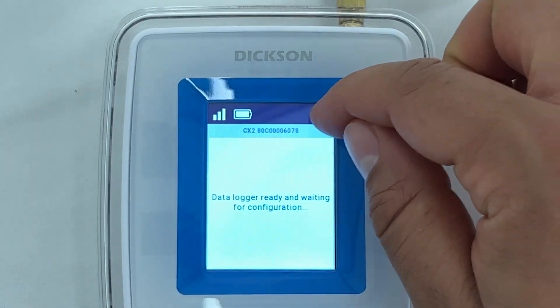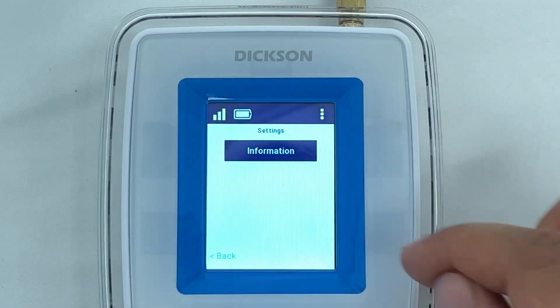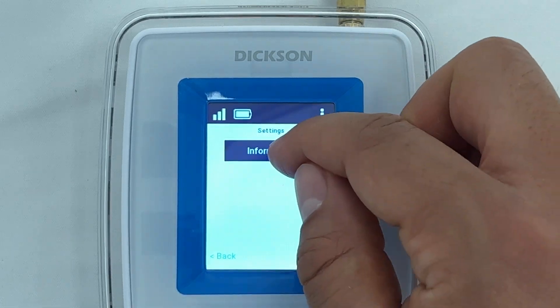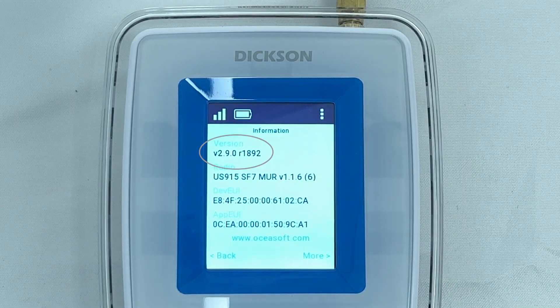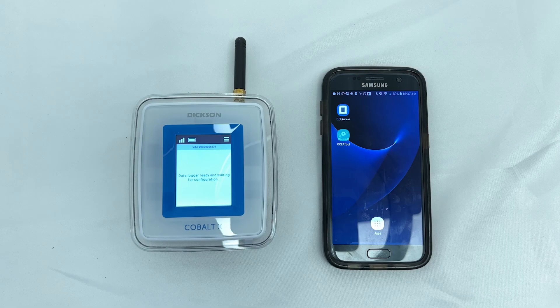Check the firmware under Menu, Settings, Information. This tutorial covers upgrading firmware on the Cobalt X2.